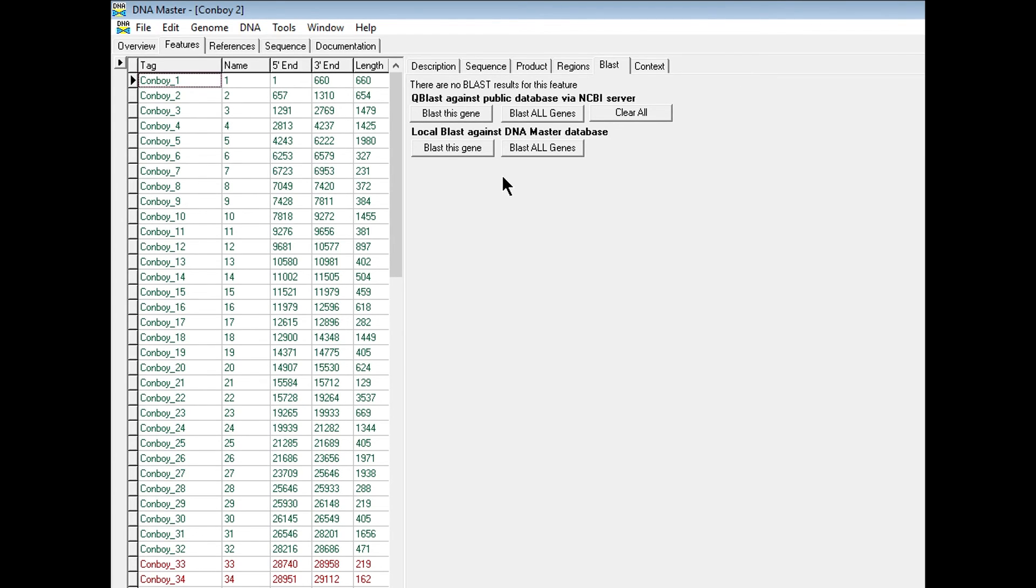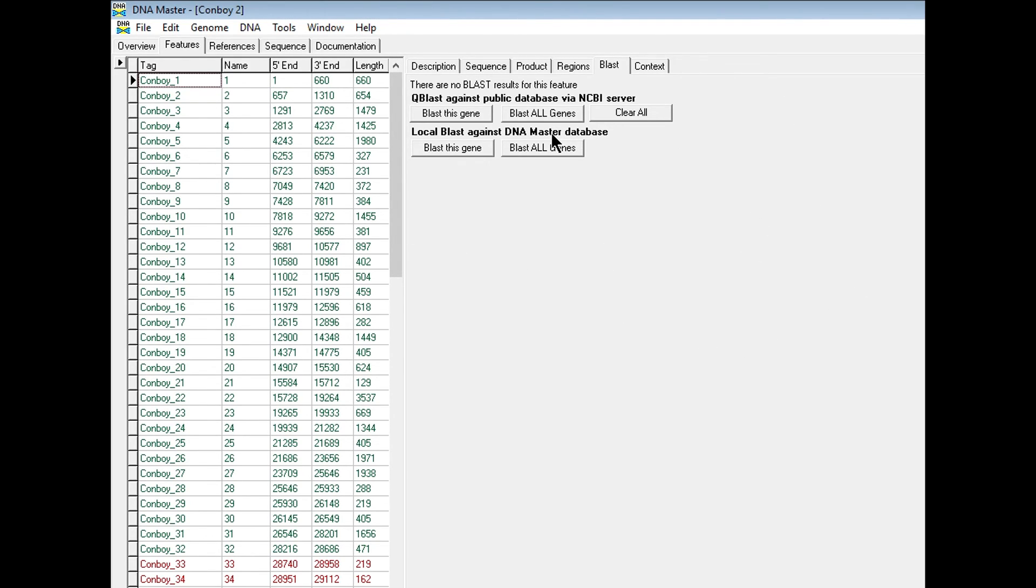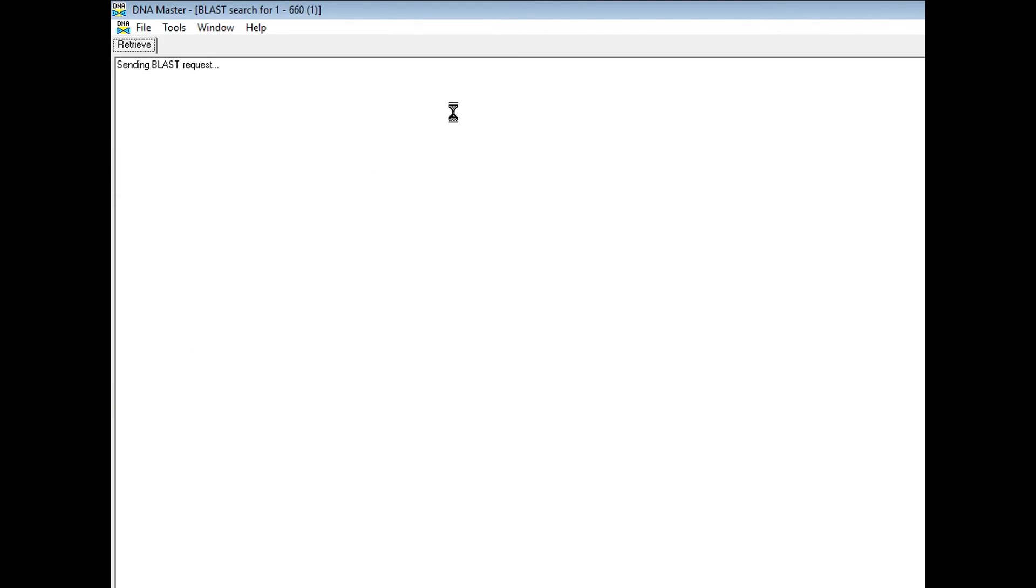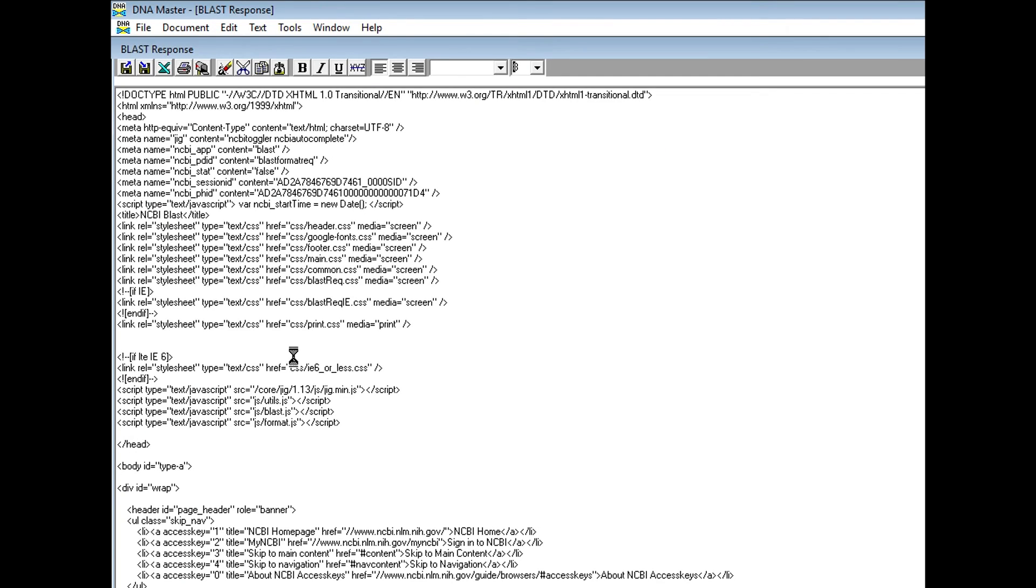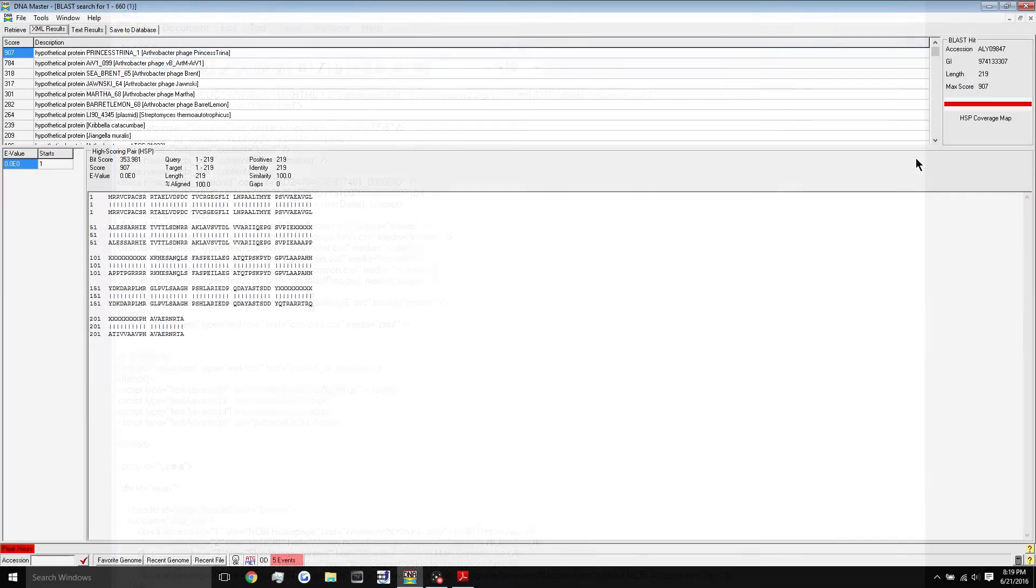But you may notice, even if you blasted your genome, some of the blast tabs are empty. This means that there were no good results for that blast result, and DNA Master didn't copy back any of those results. Usually, if you did blast your whole genome and this shows up, it means that there weren't any good blast results. You can also try again by hitting blast this gene, and it will send a blast request to the server, take a little bit of time. After some time, you'll get your blast results in a separate window.